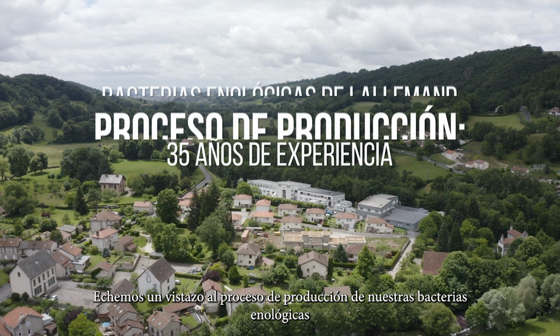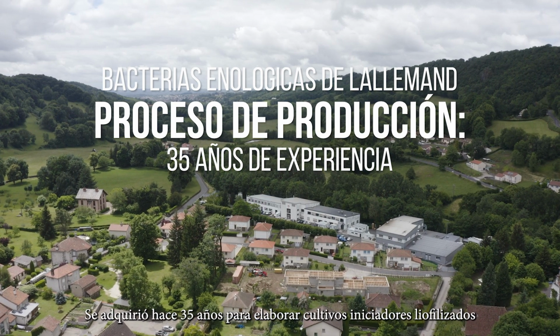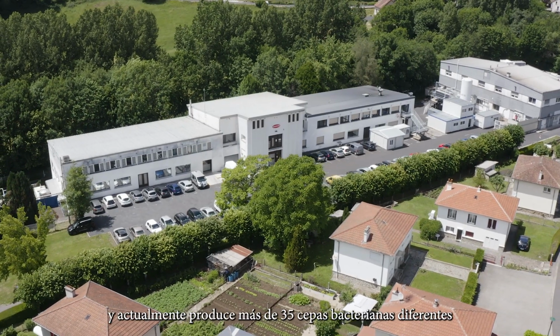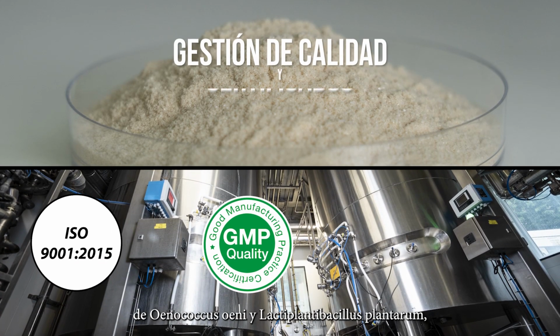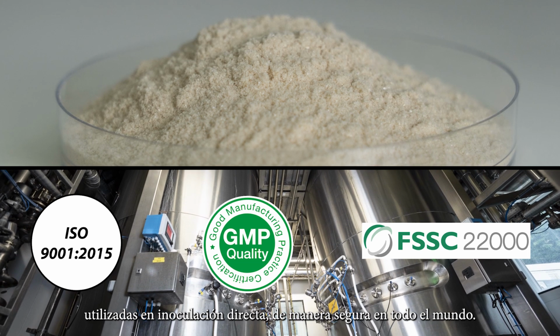Let's take a look inside the production process of our wine bacteria at our plant in Saint-Simon in France. Acquired 35 years ago to provide freeze-dried starter cultures for French sparkling wines, we now produce more than 35 different bacteria strains of Oenococcus oeni and Lactobacillus plantarum, used reliably in direct inoculation worldwide.